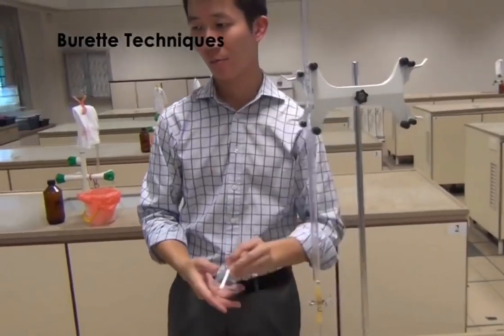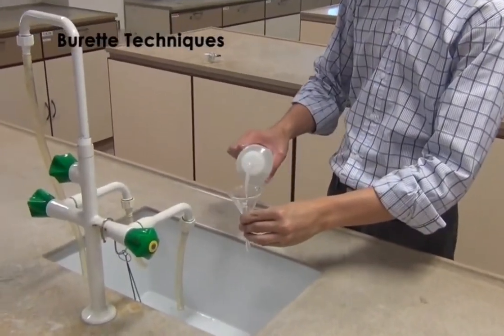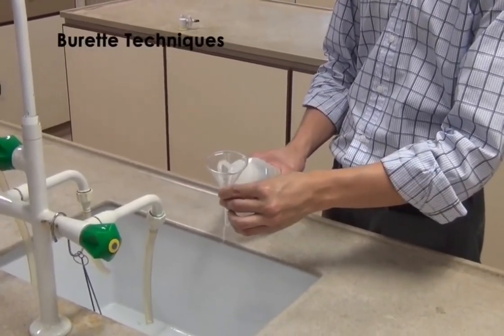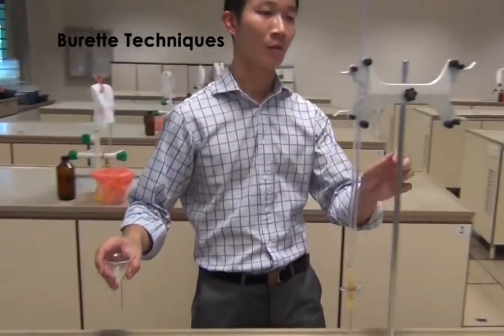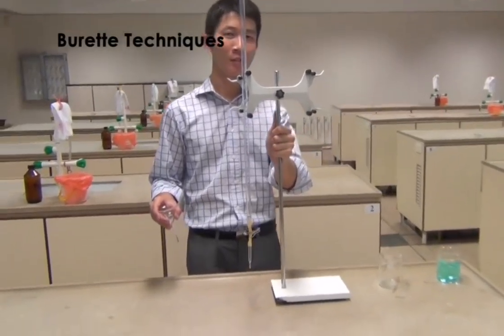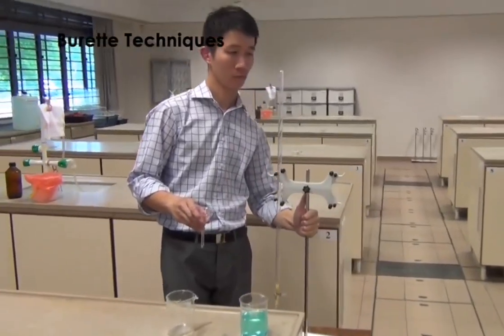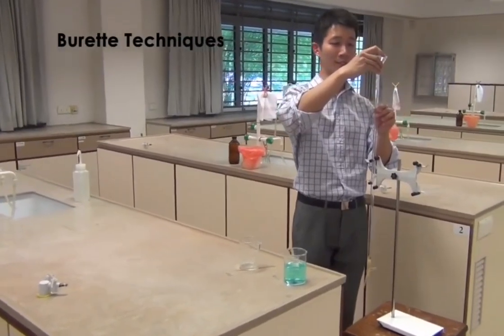Next, proceed to clean the glass funnel using deionized water. Once the glass funnel is clean, position the burette with the retort stand onto the stool. Next, place the clean glass funnel onto the top of the burette.